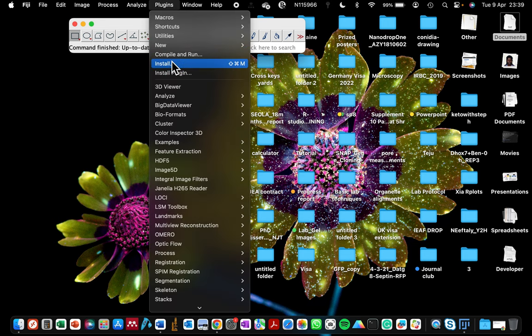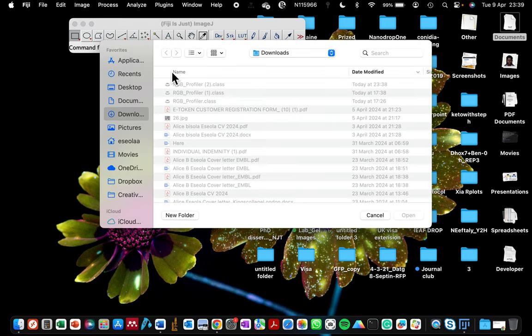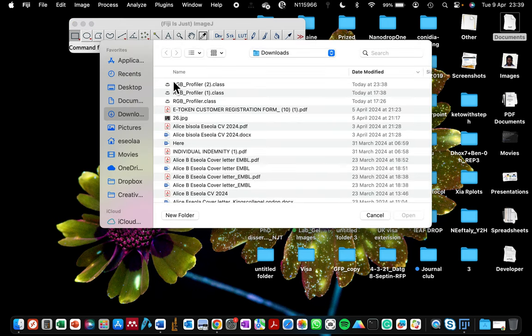You'll see where it says install or install plugin - it doesn't matter which of the two you select, it's the same. If you click on install plugin, choose the plugin that you just downloaded and then click open.